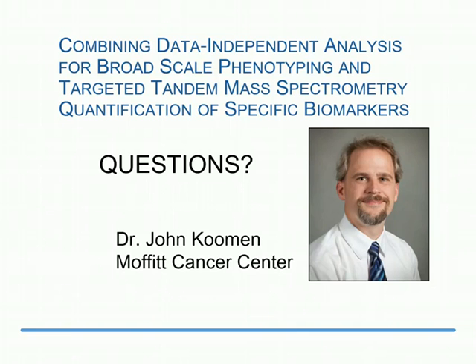I did recently, and I will probably sound like a horrible corporate shill again, talk to somebody at Thermo who developed a method for quantifying the amount of digested peptide in very small samples. That's a product that's maybe released already, I'm not sure. We haven't used it, but that's one of the things that we'd like to try.